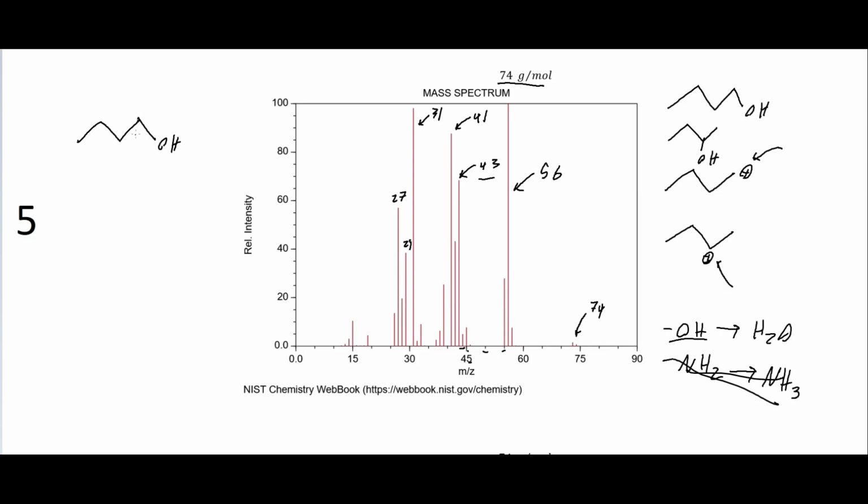And so we can actually get this to come off that way, or we can even get it to come off that way. And if we get it to come off this way with the positive charge going that way, then what we will have is a fragment with size... So the oxygen is 16, the carbon is 12, and then we have two hydrogens coming off of this carbon right here and this one hydrogen there. So plus 3. We get 16, so 28, 29, 30, 31. So 31. Well, we have a fragment that is indeed 31.